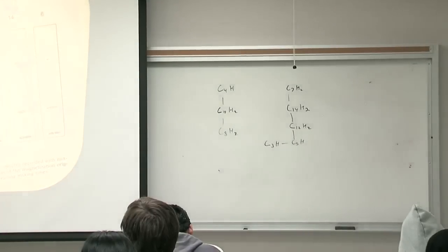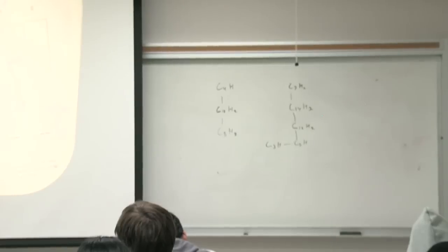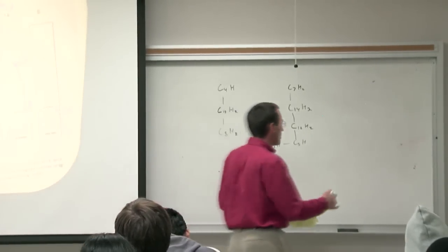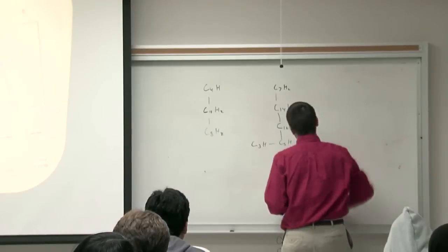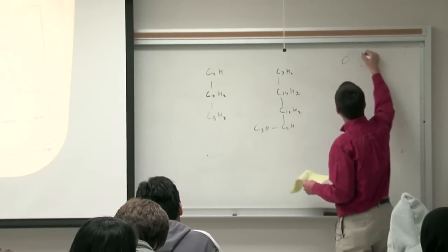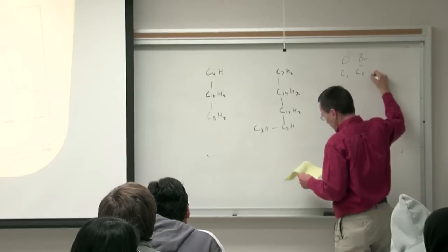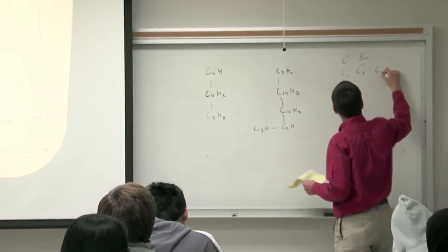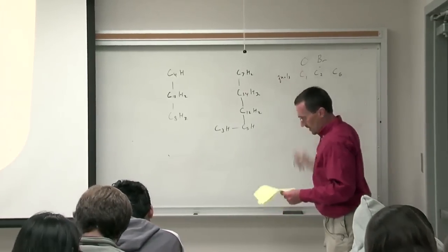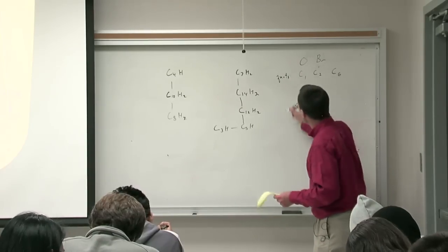All right, so that basically gives us our spin systems without ever having to deal with that quagmire of the COSY. Now, we're at bromomalleol, so we have a bunch of stuff that we still need to deal with. We have an oxygen, we have a bromine, we have carbon 1, carbon 2, carbon 6 that are unaccounted for. These are our quats. And then we have our isolated methyls. So we have all of these methyl singlets.